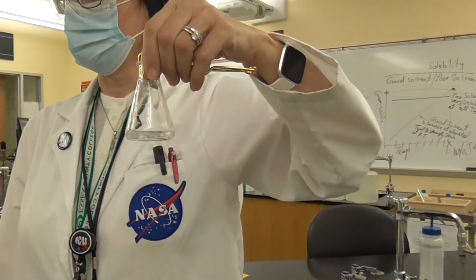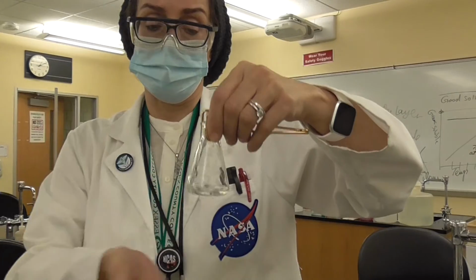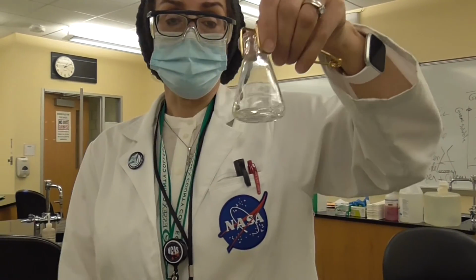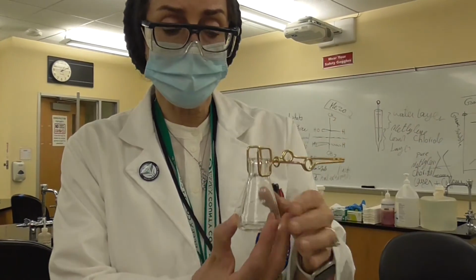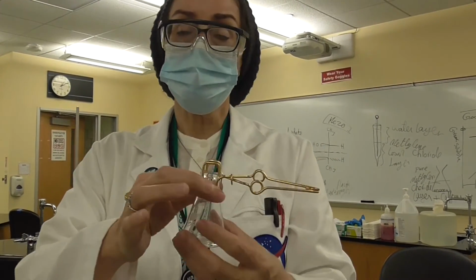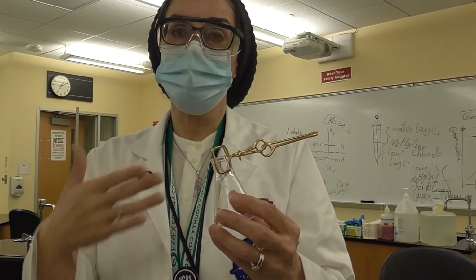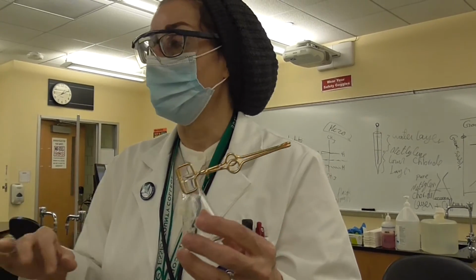The following step is we are going to weigh this flask when it is empty, and then we are going to weigh it again after we evaporate the methylene chloride. Methylene chloride's boiling point is very low. It's like room temperature, in the 30s. So we have to be very careful because it is volatile. Volatile meaning it could also be flammable if we heat it.